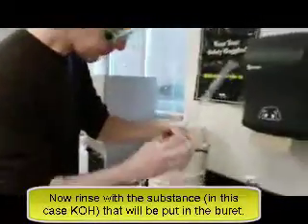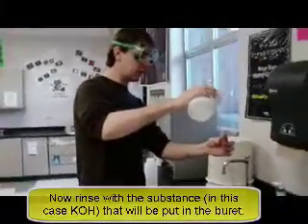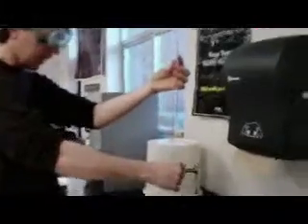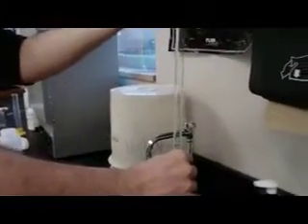And once you've done that, you'll notice that there's still a little bit of water in here. You don't want that, so make sure that's all out, and we're also going to take steps to make sure that's all gone by rinsing with the stuff we're going to put in there. So I'm going to be titrating with the potassium hydroxide, so I'm going to do a quick little rinse with potassium hydroxide as well. In the same fashion, just pour a couple milliliters in there into the bottom. Now that's potassium hydroxide, guys, so he's actually rinsing with the KOH. What this is going to do is get rid of any residual water that's in there and replace that with the stuff that we're going to be using to titrate. Because if you have water in there, that's going to affect the concentration of your potassium hydroxide, and it's going to introduce error into your experiment.